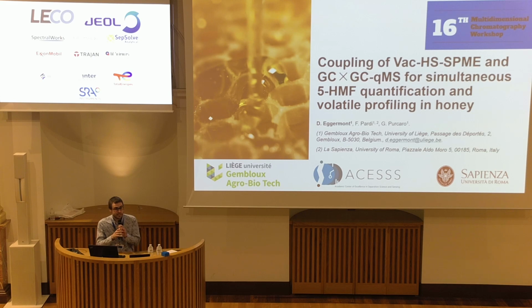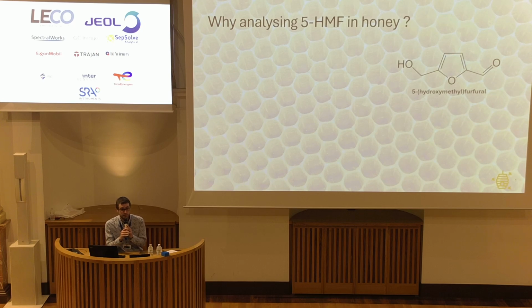So I will directly start by talking a bit about honey and especially about the 5-hydroxymethyl furfural. So the question here is, why do we have to analyze these compounds? This is a compound that is produced during heat processes and with time. So it's a global indicator of freshness of the product.